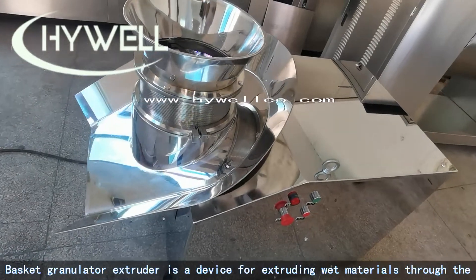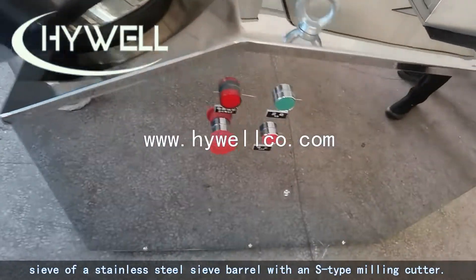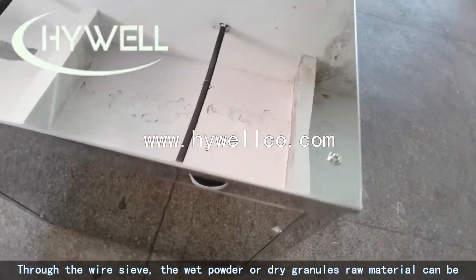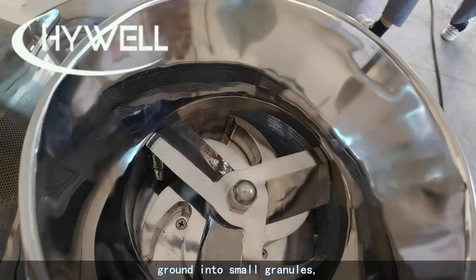The basket granulator extruder is a device for extruding wet materials through the sieve of a stainless steel sieve barrel with an S-type milling cutter. Through the wire sieve, wet powder or dry granule raw materials can be ground into small granules.